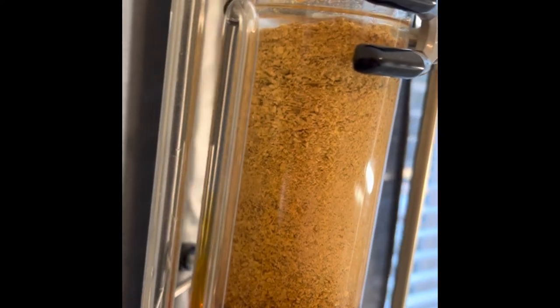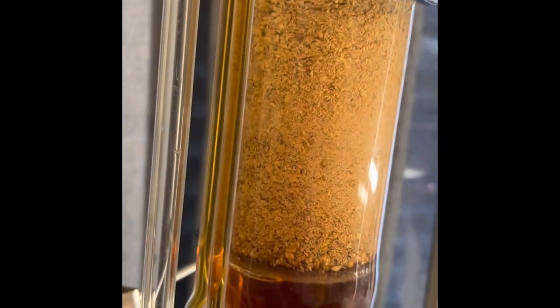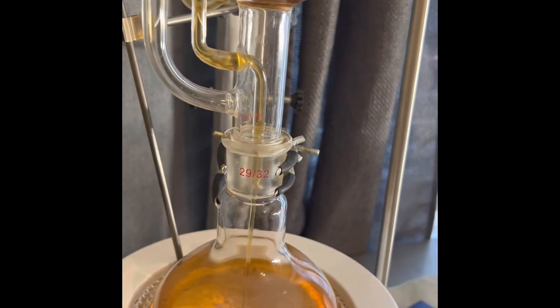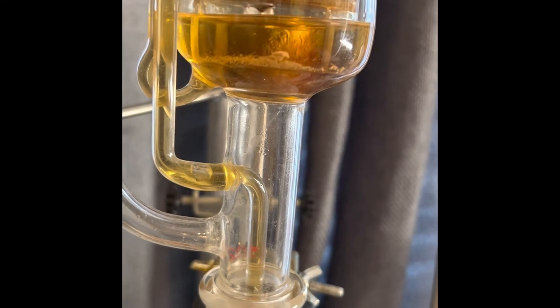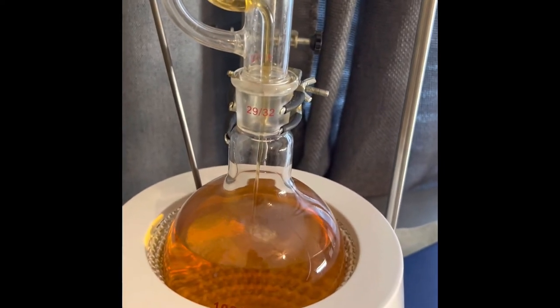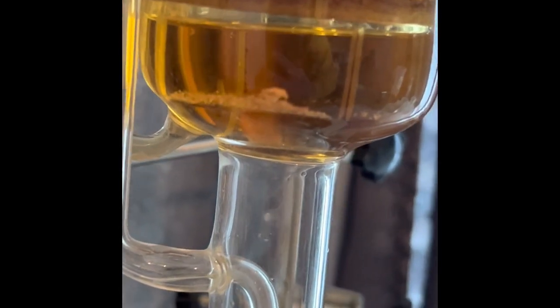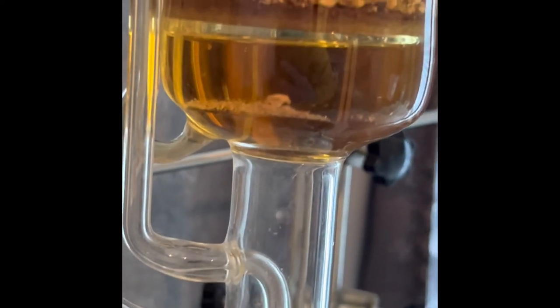I'll pull each thimble usually 3-4 times. Here she goes. First pull is always the prettiest for me. Pulling all them goodnesses out. Oh yeah. Now you see how much lighter your solvent gets the further you get into your pulls. This is the third pull. Well, about to be the end of the third pull. And I'll let it go one more.